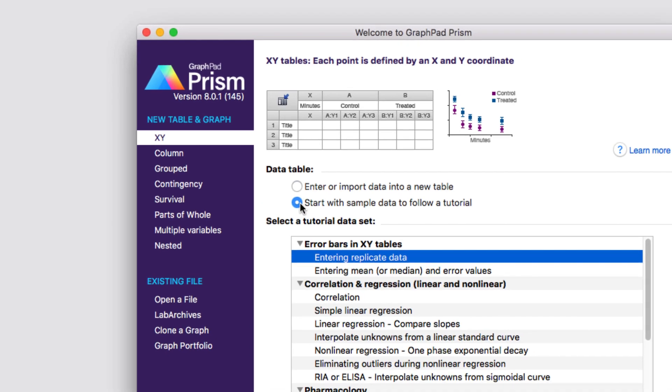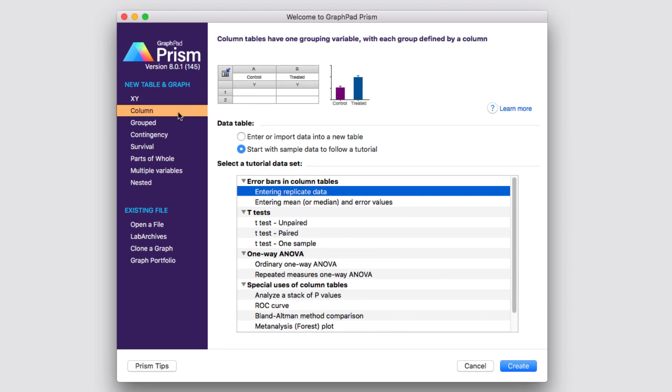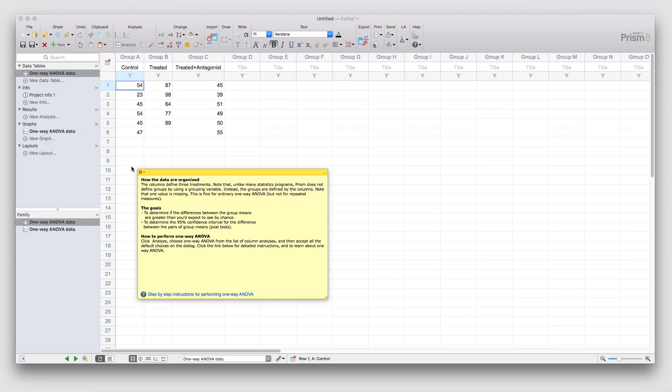We're going to start by using the tutorial data set for an ordinary one-way ANOVA under the column data table. Clicking create brings up the project file and shows you the tutorial data. However, like other tutorial data sets, this only shows you the data. You'll still need to perform the analysis yourself so you can learn how to better navigate Prism.